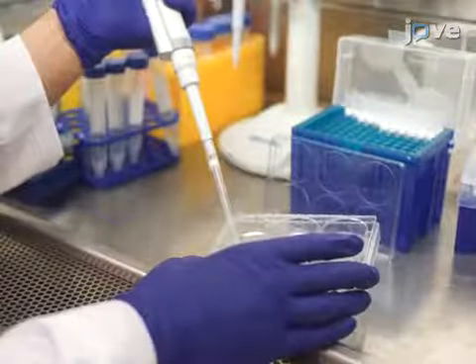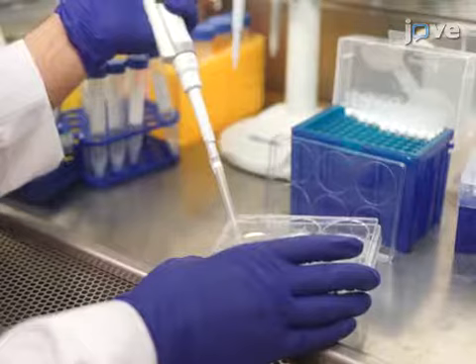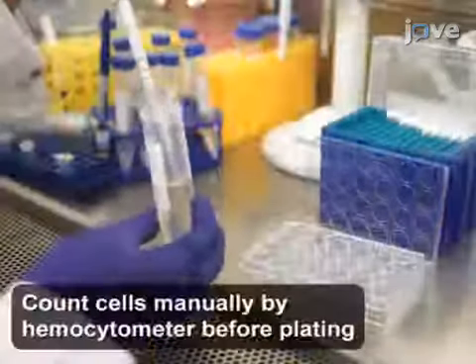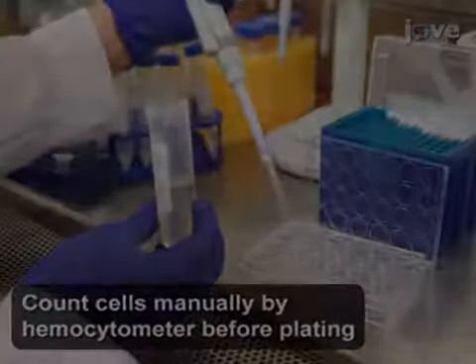Harvest the double-stranded RNA-treated S2, control, and S2 Notch cells by gentle pipetting, and plate 2.5 × 10⁵ cells per well in a 24-well plate.